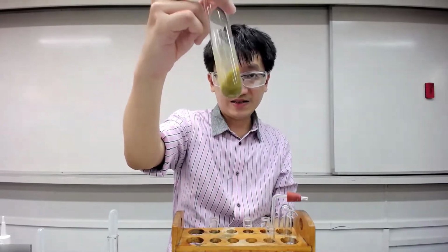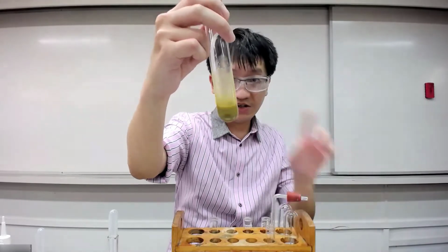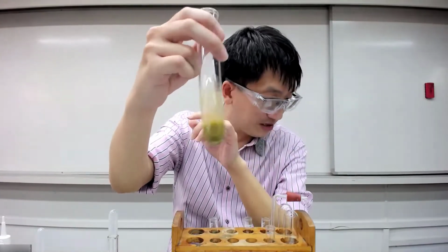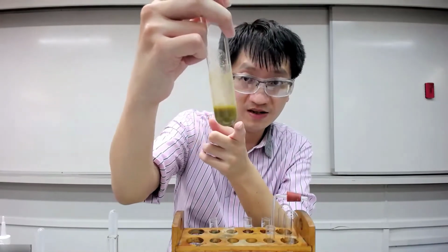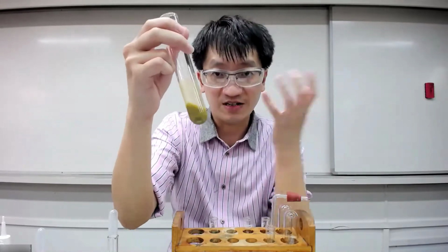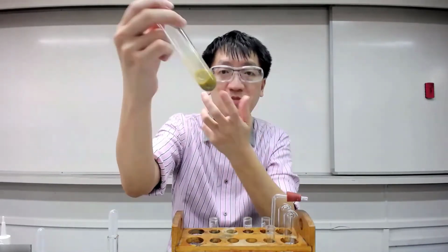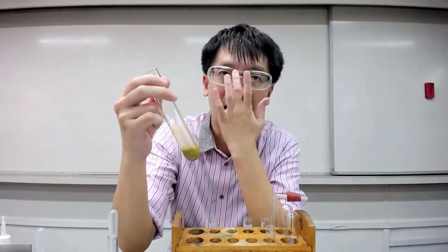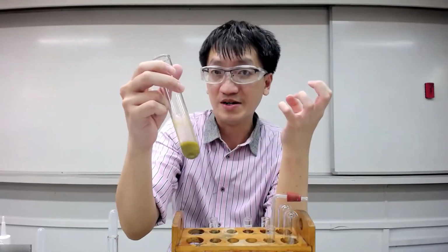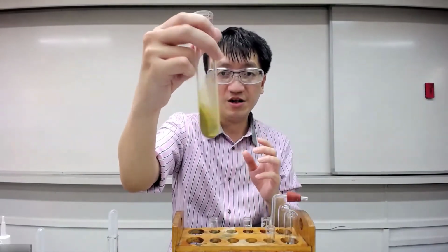So at this instance, if you look at your worksheet, what did they ask you to record? After you add 1 cubic centimeter, what is this? You should be saying brown, right? You're not lying to yourself. Of course, you know that they are copper 2 too, but you can't tell it's copper 2 from here. But just now, without swirling, it gives the game away. So that's a key thing. This is a good technique, which I think all of you should learn.